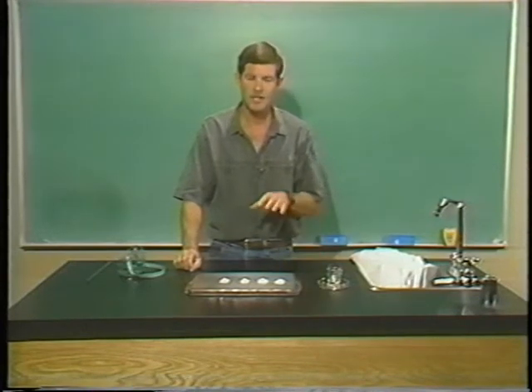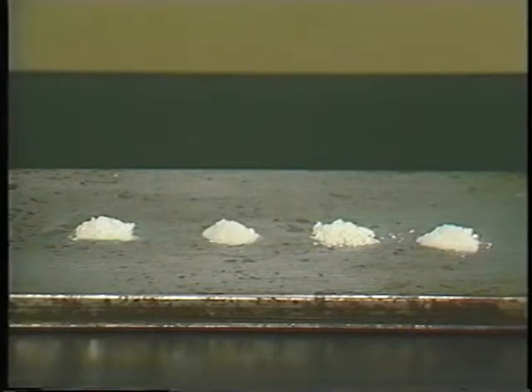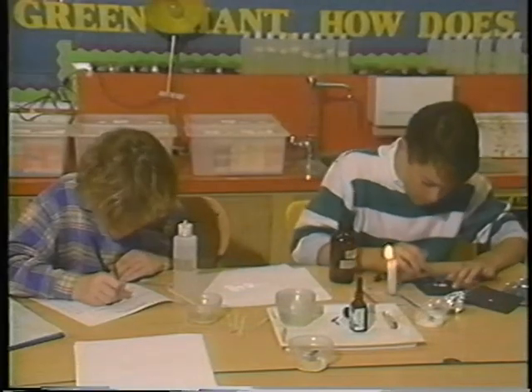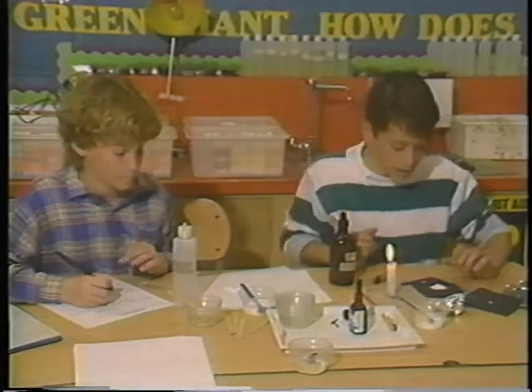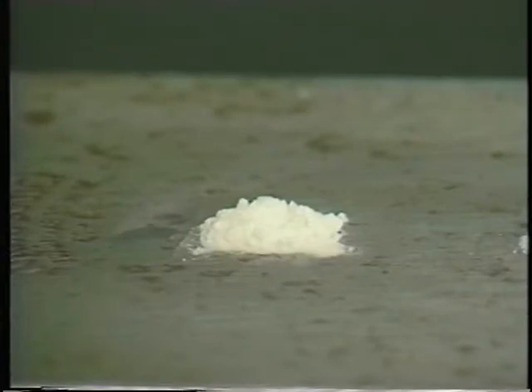Let's start by taking a look at these four white powders I have on the table. You may have done an experiment called mystery powders. Well, these could very well be one of the mystery powders that you've worked with. Now, if I asked you to come up and test these, do some experiments with them, and try and figure out what they were, would you taste it, or touch it, or smell it? Would that be safe if you didn't know what it was? Well, we're going to do one experiment. I'm going to add just one drop of water to each little powder, and we'll see what happens.